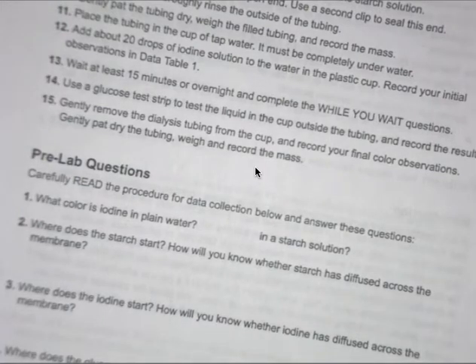Number 2, where does the starch start? As in, where did you initially place starch? How will you know whether starch has diffused across the membrane? Now remember, this is going back to where the starch is placed. Where is the iodine? What happens when the two combine? So how will you know if starch moves across the tubing?